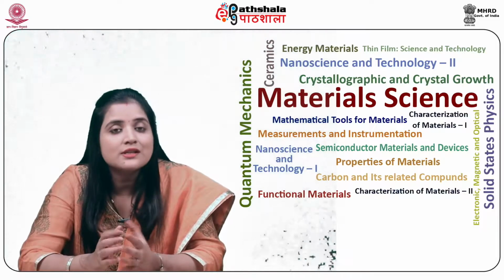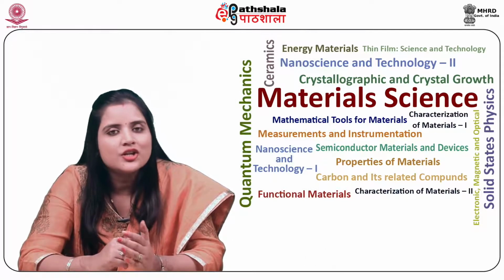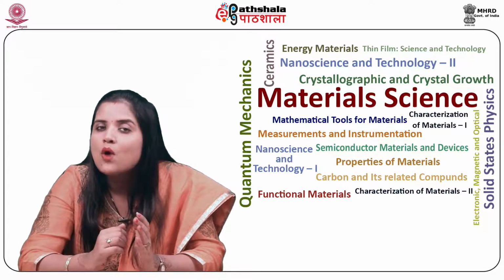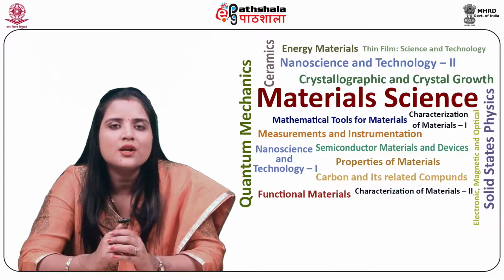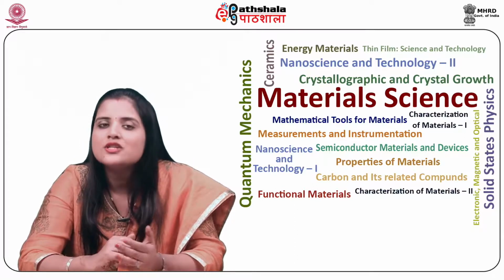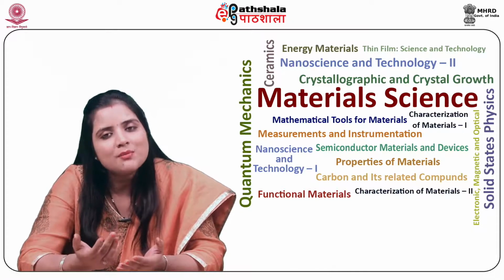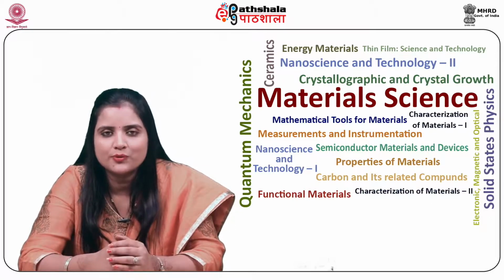Let us now discuss the qualitative analysis. The X-rays generated EDS spectrum helps to carry out qualitative analysis to identify whatever elements are present in the sample when it is irradiated with a high energy beam of electrons. There are three methods of examination. First one is the point analysis. That is, the spectrum is obtained from a point which is radiated with the electron probe.